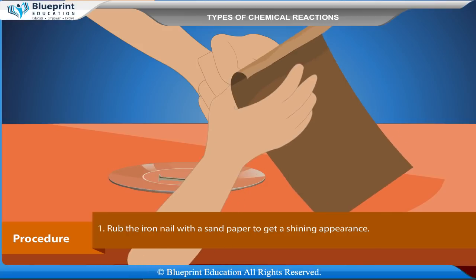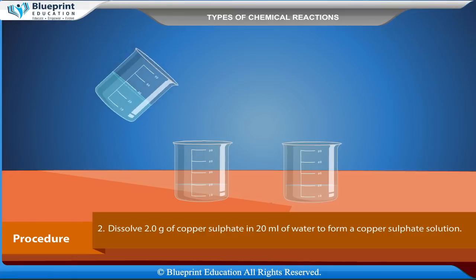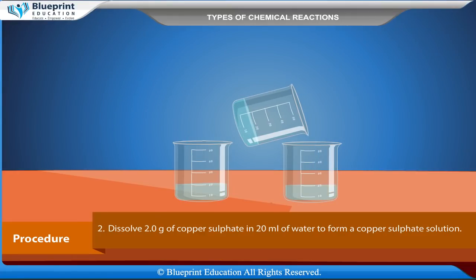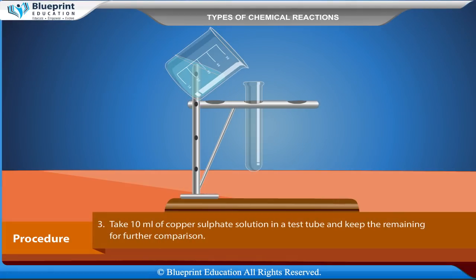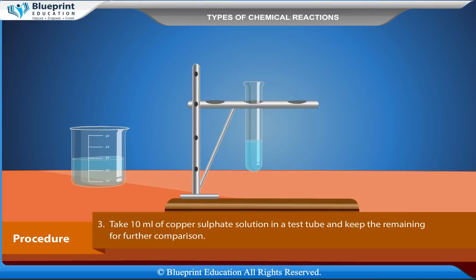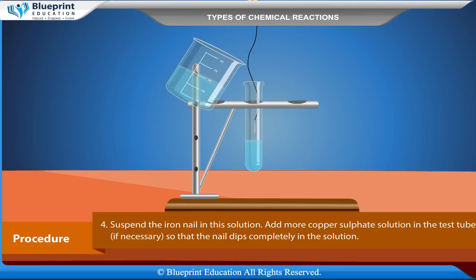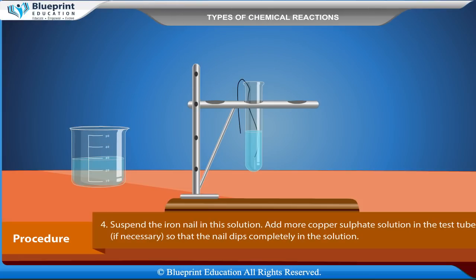Rub the iron nail with sandpaper to get a shining appearance. Dissolve 2g of copper sulphate in 20ml of water to form a copper sulphate solution. Take 10ml of copper sulphate solution in a test tube and keep the remaining for further comparison. Suspend the iron nail in this solution, adding more copper sulphate solution if necessary so that the nail tip is completely submerged.